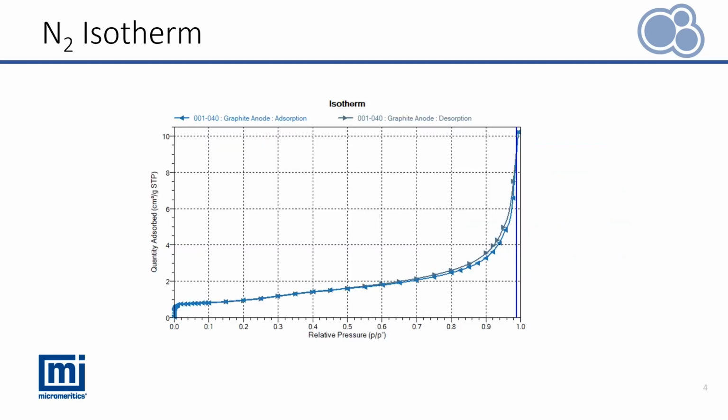With that, it leads to the main characterization method we'll focus on in the scope of this webinar, the nitrogen isotherm. With the nitrogen isotherm, the BET surface area and pore size distribution up to 100 nanometers of a material are most commonly characterized.